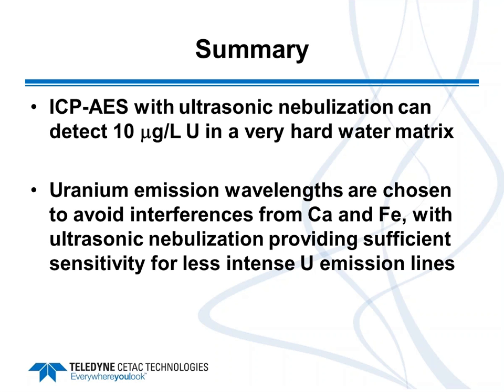Does this mean that the ultrasonic nebulizer eliminates the problem of total dissolved solid content, TDS? No, the ultrasonic nebulizer will not remove non-volatile inorganic solids. In fact, it will actually send more of it into the ICP. So with that in mind, you have to be wary of the dissolved solids content. In general, we recommend between 0.1 and 0.5% total dissolved solids. Above that, of course, you can overload the ICP, and in the case of ICP emission, you can suffer very large signal suppression. And in the case of ICP-MS, you can have salting of the interface cones. So the solid matrix, like the salt, is not removed.